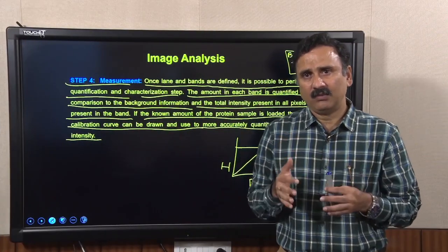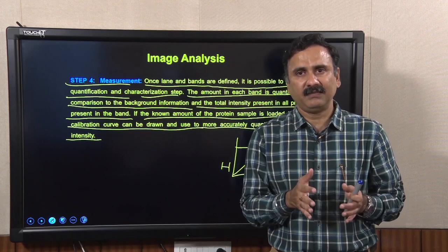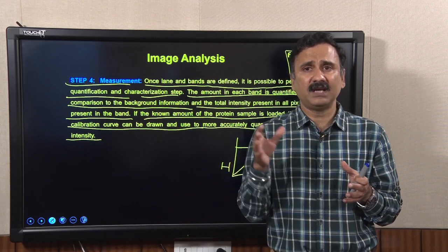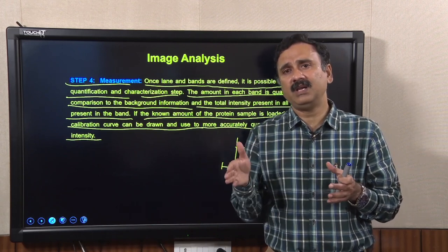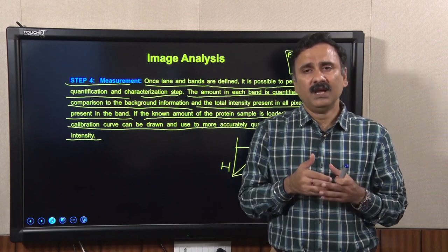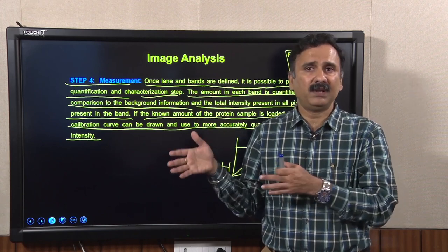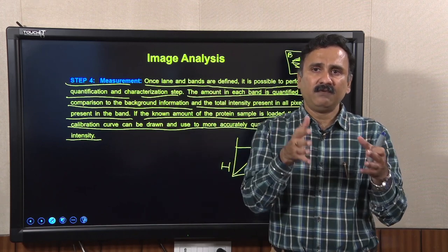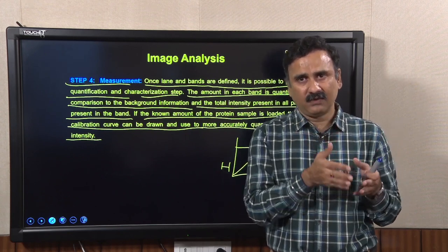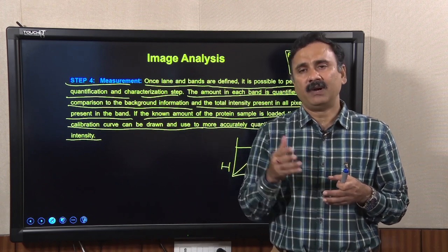So in this demo, the students have explained to you how to select the lanes, how you can measure the intensity in every step, and how you can determine the molecular weight of the particular protein. Because in the example the student has shown that if you have a molecular weight marker run onto the gel in one of the lanes, you can use that information even to calculate the molecular weight.